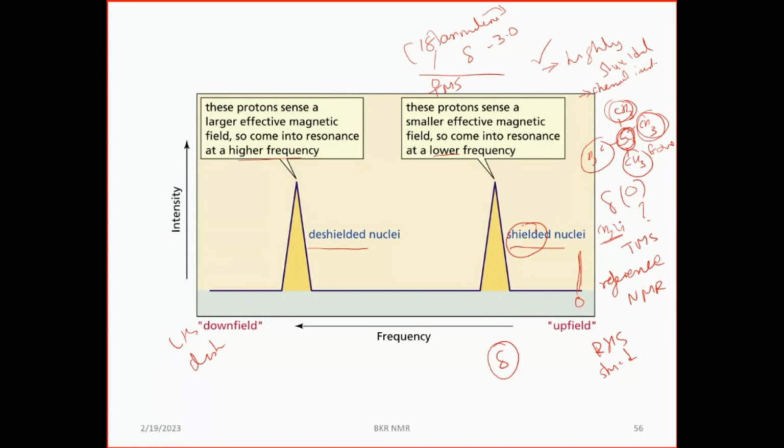First reason: in tetramethylsilane all the hydrogens are shielded. They are shielded in most of the organic compounds, so I can fix it at 0. I agree some compounds are more shielded, but why can't I choose them? As said, TMS is chemically inert. It will not react with the organic molecule. If you take methyl lithium, it is highly basic in nature and has carbanion character. It will react with the organic molecule, so I cannot take it.